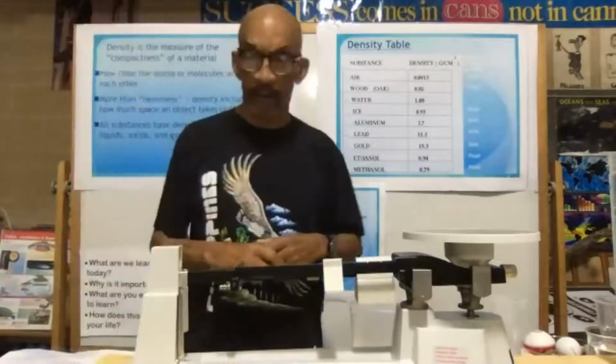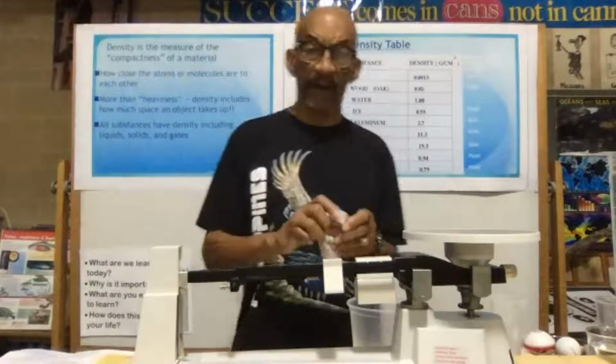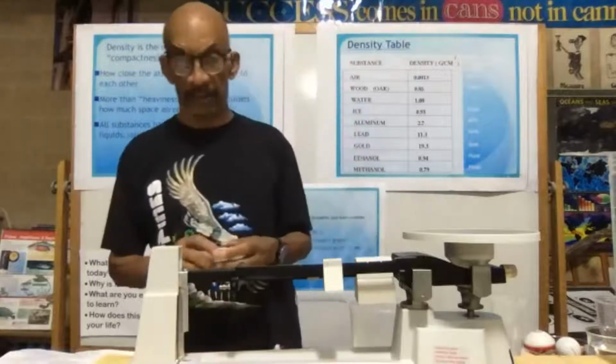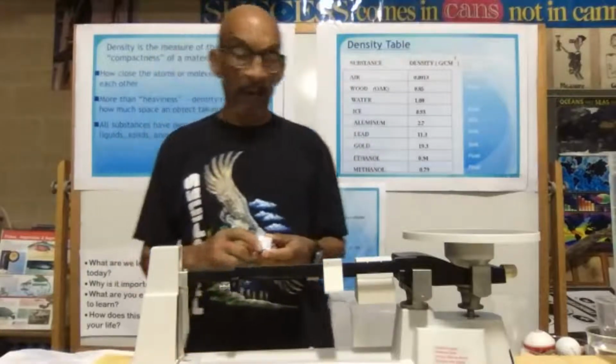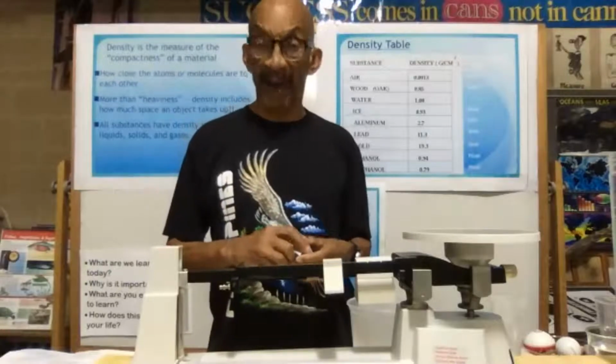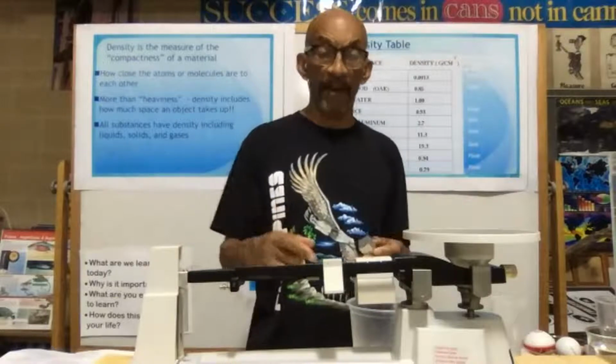I want you guys to pay attention now. We're going to start off by trying to figure out the density of this cube. Now, to save time, I have already done some measuring. First of all, the formula talks about determining the mass of the matter. So to do that, we're going to use the triple beam balance.